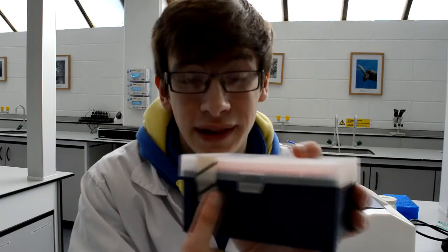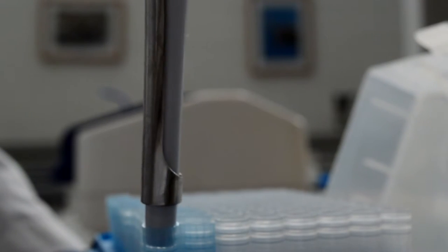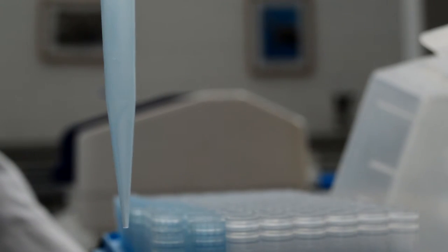They tend to come sealed with a little bit of tape because they're sterilized, and that way you can use them with genetics and 101 other things. So a little bit of advice as far as putting the tip on the end of your pipette goes is try and do it at a little bit of an angle so you don't jam the tip back into the box, and try and close the box after you've taken out your tip. That way everything just stays sterile and you know you're going to get a better result.